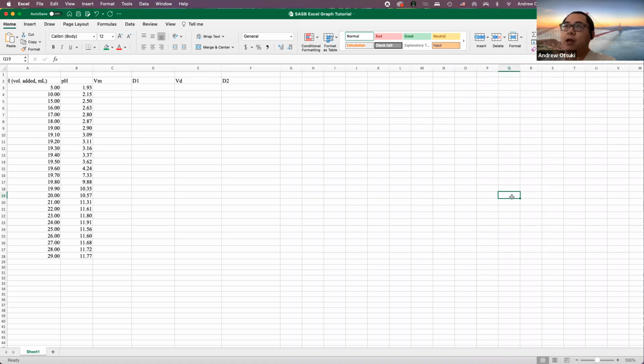Sorry, not next week, this Friday, when we do the second titration experiment with titration of a weak acid, acetic acid. But in this lab, I'm going to be more of a boot camp sergeant, going to kind of drill you guys to do this quick. Because we only have 3 hours, and in the real world, when you go work at a company or an industry, you can't dilly-dally and take forever to do a task that should have taken just a fraction of the time. So it's okay to make mistakes, but we need to improve our skills and learn how to do these things in a timely fashion. And I'm here to guide you.